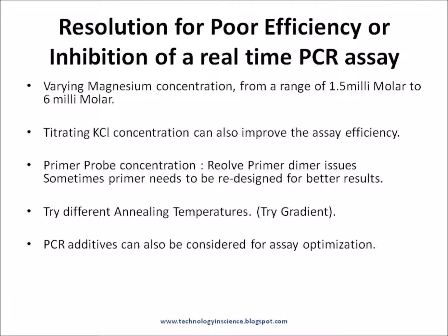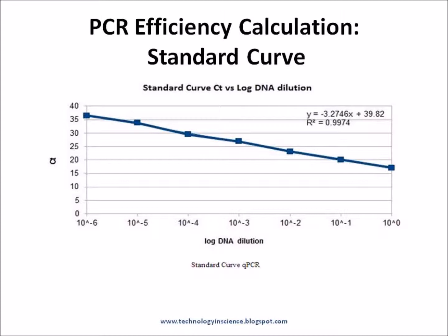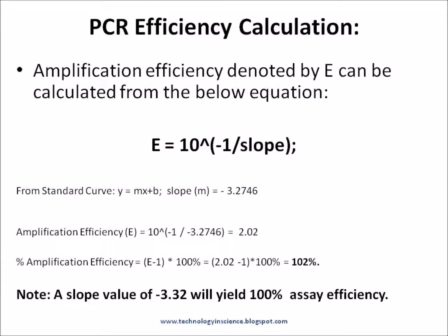Following these steps should bring the real-time PCR assay efficiency to within the range of 90% to 105%. Note that a 100% assay efficiency yields a standard curve slope of minus 3.32. The real-time PCR assay efficiency can be calculated using the corresponding formula.